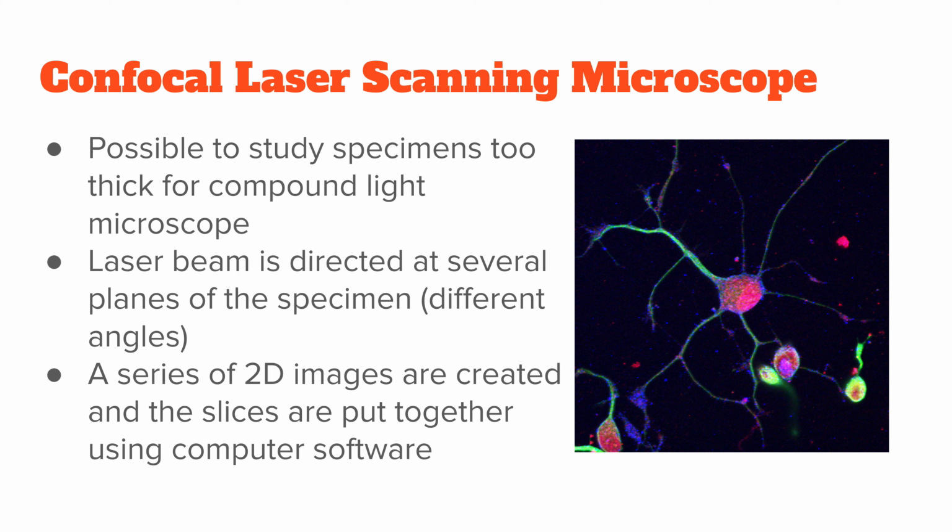And we use laser scanning microscopes on samples that are too thick for a compound light microscope, but also don't need the same level of resolution as in detail as an electron microscope.